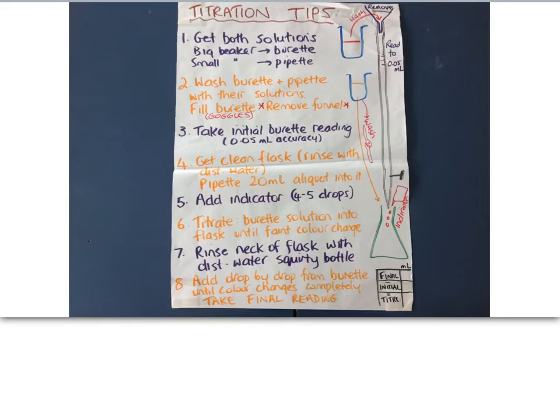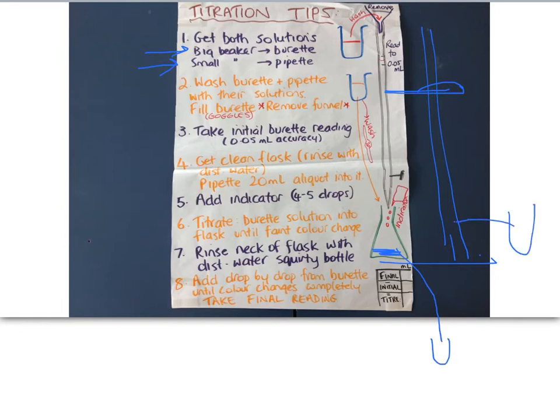When you have set up your pipette, you'll have a retort stand like this holding the burette, a special clamp that's made specially for burettes. You will need to go and get both solutions. The one that's going to go into the burette, put in the big beaker. So you've got B for big beaker and B for burette. And use a smaller beaker to get the solution that you're going to be putting down into the flask. So the small beaker goes into that one and the big beaker goes into the burette.